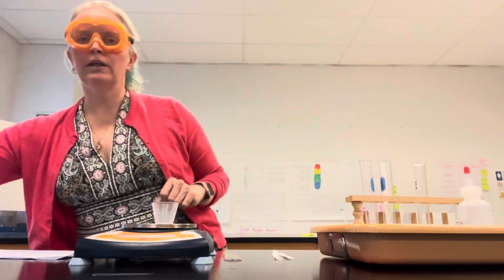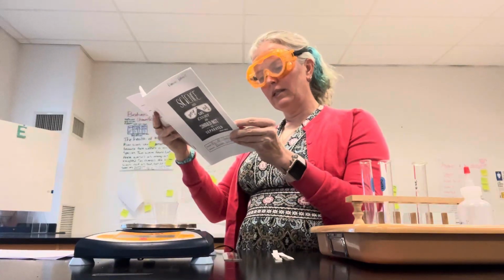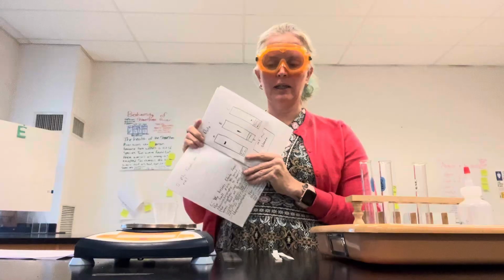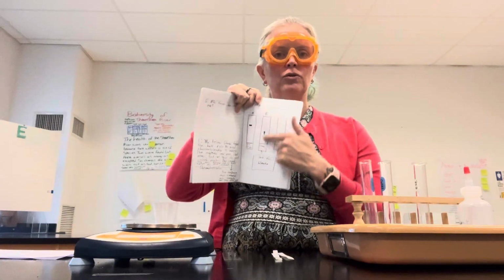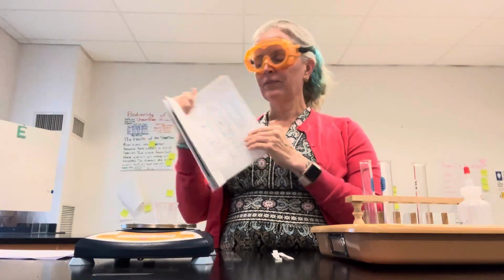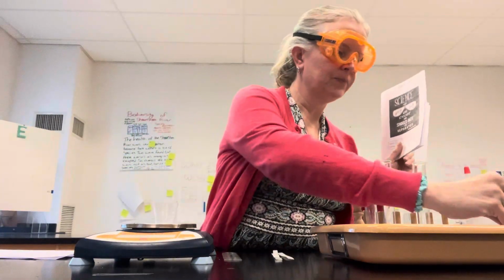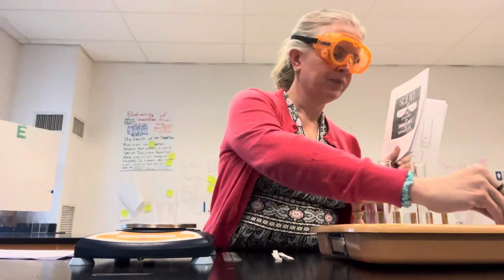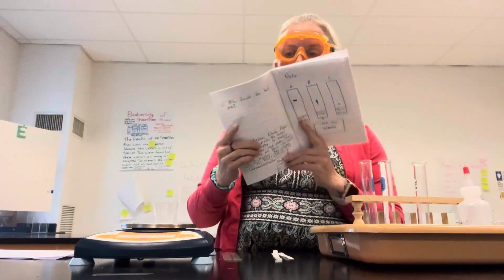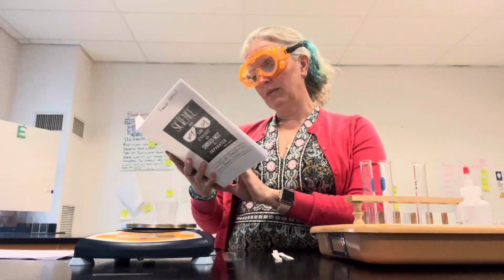So I wanted to show you an example of how the conclusion might look for this lab. So in most of our labs, we have numbers for data. In this lab, I'm not going to ask you to write down numbers, but you are going to draw the 3 strips of paper from the 3 pens, and then you are going to explain how you matched the pass to the marker. And you need to be specific. So you want to use specific colors or descriptions in your explanation. It will help if you have the data right there so I can look at it side by side.